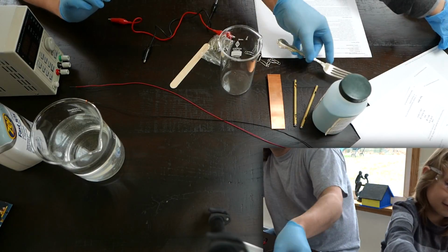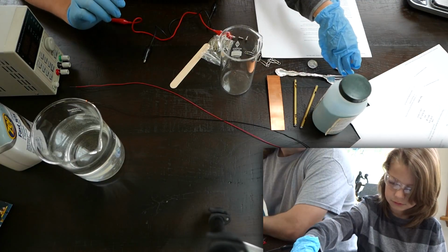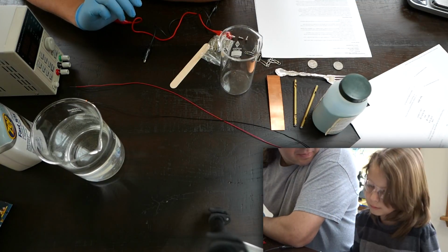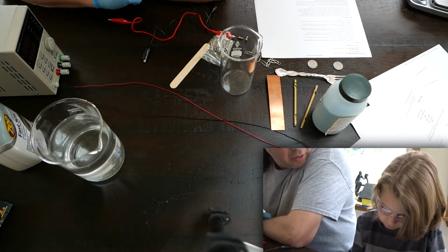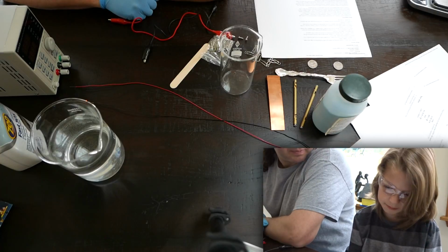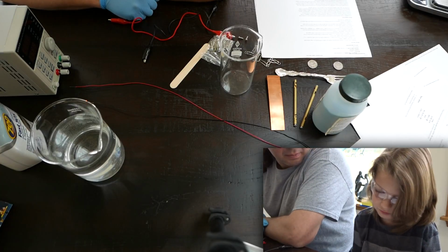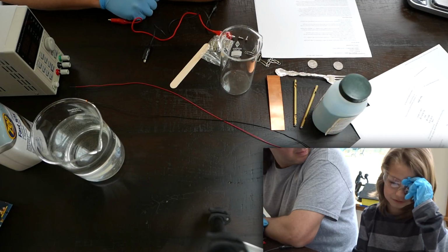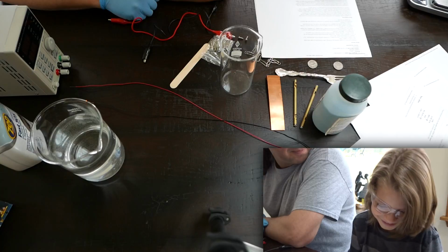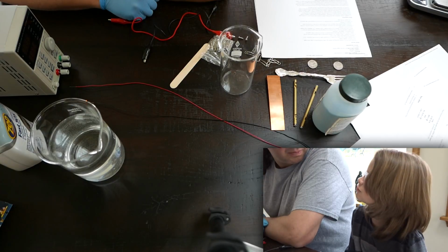Fork and 2 quarters. Does it say where? These 2. Okay, so you want to attach? Okay, how far did you get? I'm sorry. 2. Stir the copper sulfate into some hot water in a beaker until no more will dissolve. Your solution should be dark blue. Let it cool. Okay.